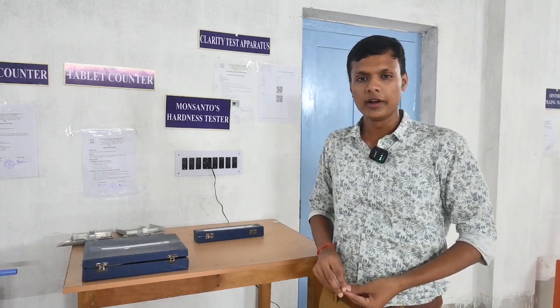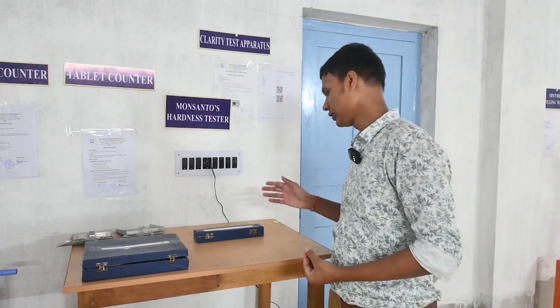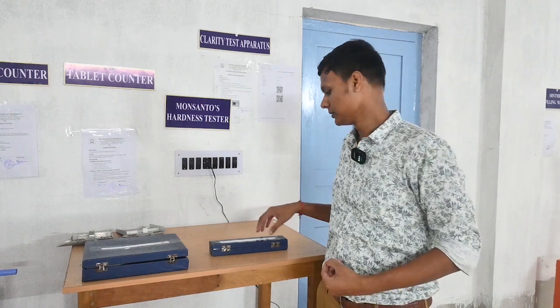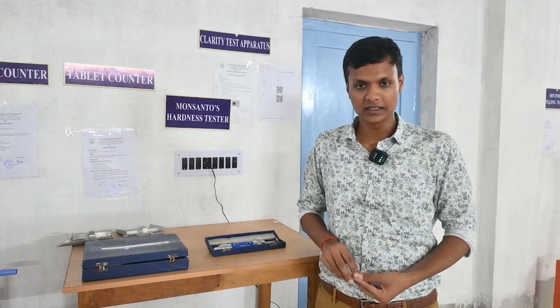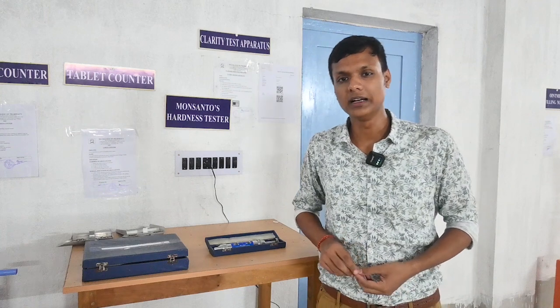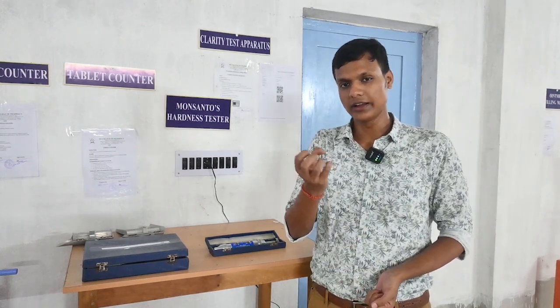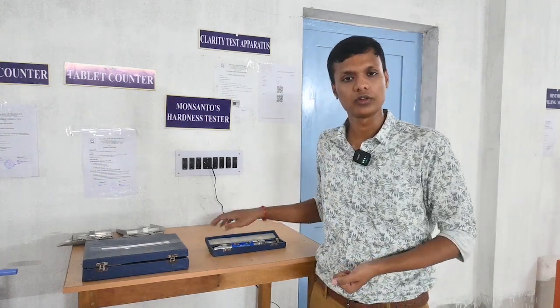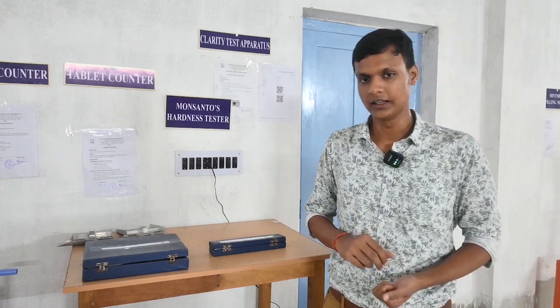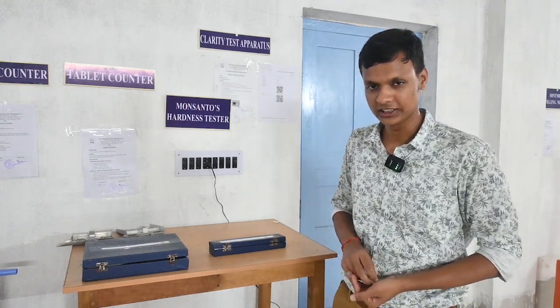Good afternoon everyone. My name is Saikat Baumik, assistant lecturer of NS Pharmacy College. Today's topic is the Monsanto hardness tester — a machine used to test tablet hardness and friability. It tests how tight the tablet is and whether, through packaging and handling, the tablet will crumble into powder form. The Monsanto hardness tester basically tests tablet hardness, with units of kg per cm².